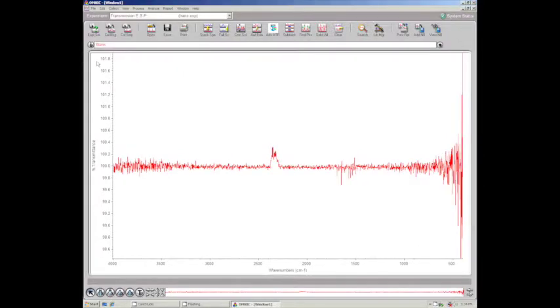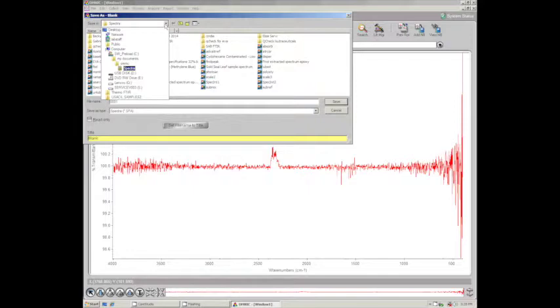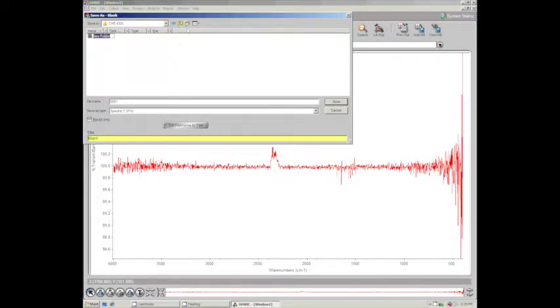You can analyze it or look at it later, but really importantly, you want to save your work. Save it in the CHE 433L folder, and within that folder, make a new folder with your name and save your work under there so that you can look at it later.